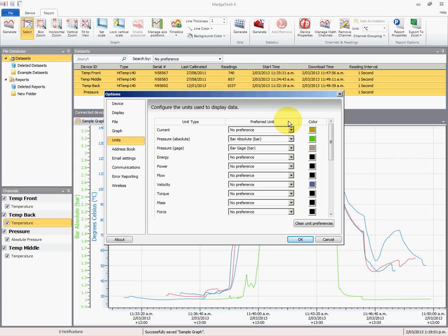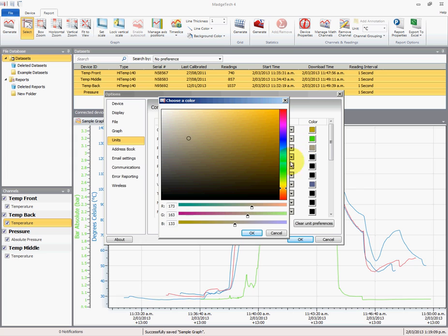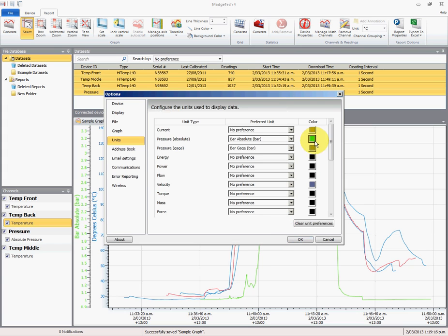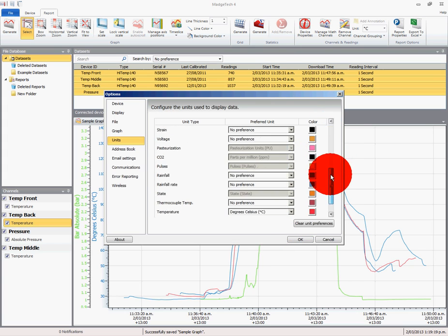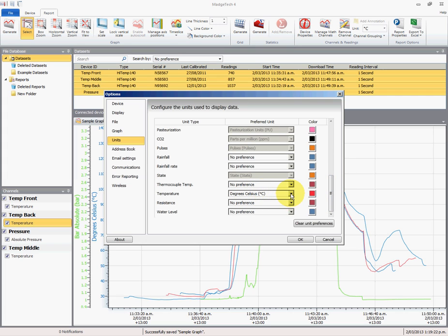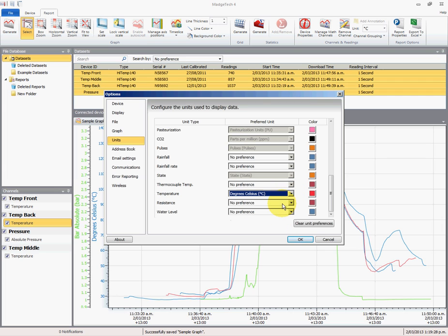So this is where I selected the colors so they came in automatically. We're using an absolute pressure sensor. So if we click on the color, we can select from the color tablet any color that we want, and I've got green. And the other one that we use is temperature. If we scroll down here you will see temperature, and we can change if I want it in Fahrenheit or Kelvin, but in this case I want it in degrees C, and I've selected the color red, which is how I like it.